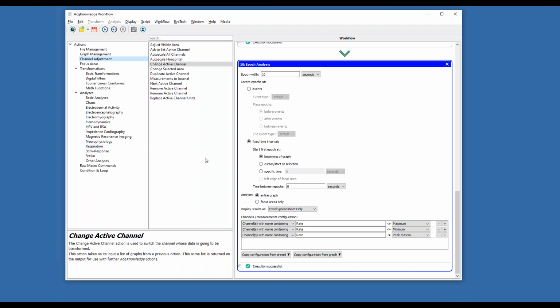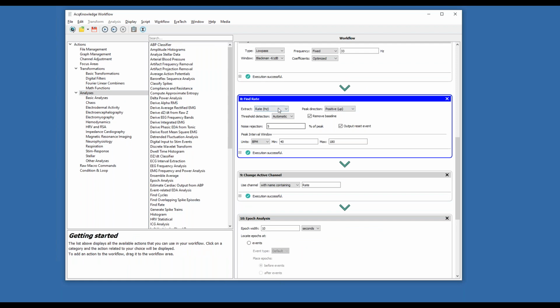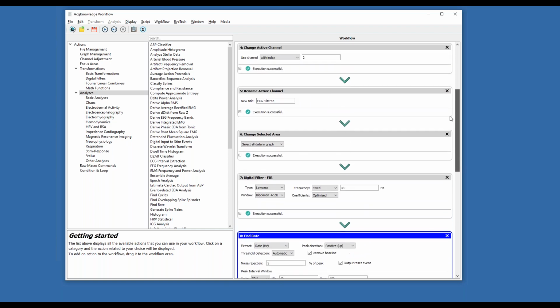So, okay, heart rate variability. I'm going to use the HRV statistical for this next portion. After we've run the AcqKnowledge analysis, I can come into analysis and drop in HRV further up within the system if I want to. It doesn't have to be on the end.